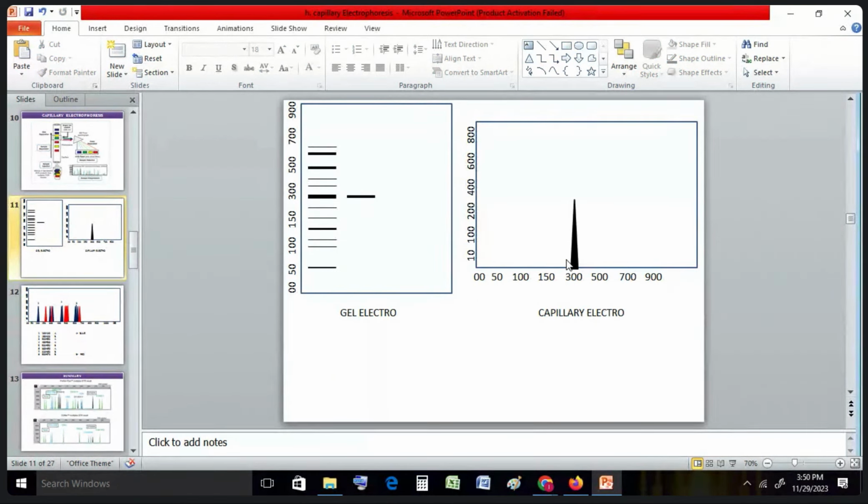Sir, if there are two 20-repeat alleles, then one is not overlapping the other? Overlap means, when you do the PCR from both alleles, it will amplify from both, and both amplifications will produce the same size product.